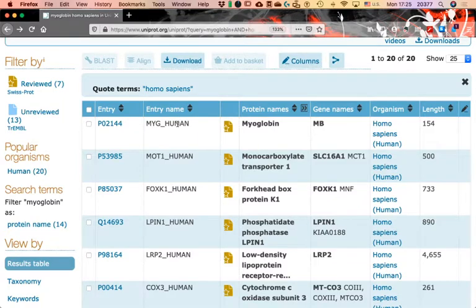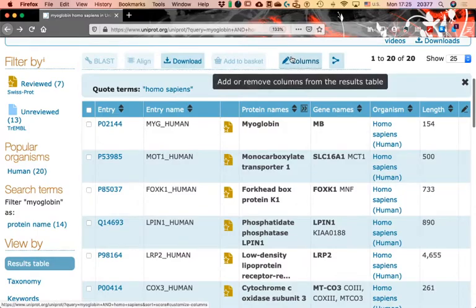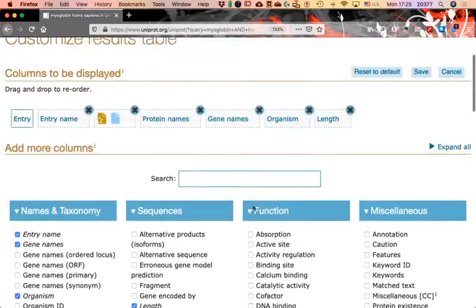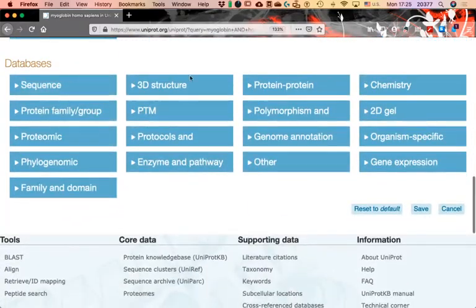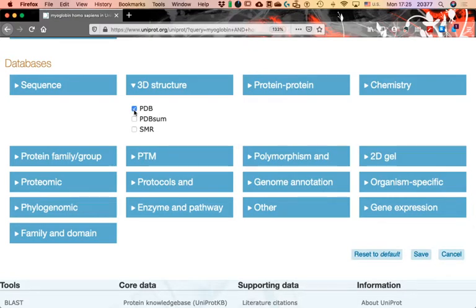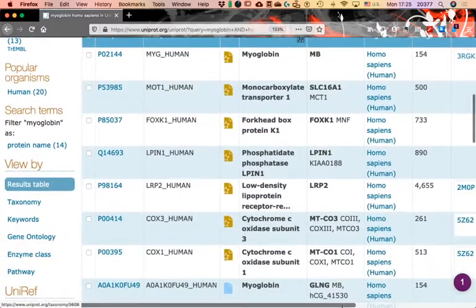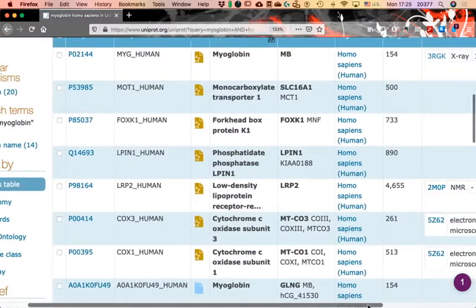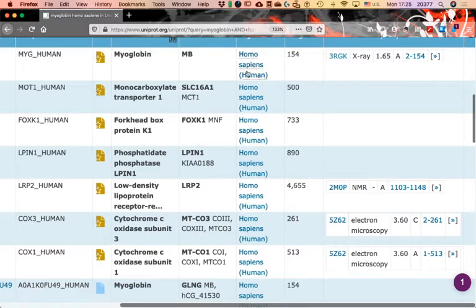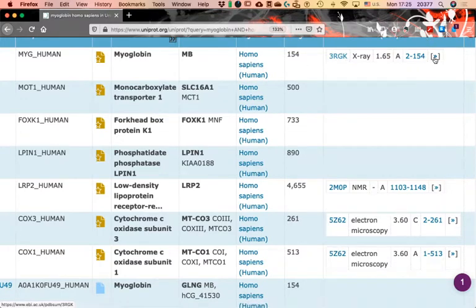On Columns, go to the bottom of the page to 'Databases,' and under '3D Structure' select PDB. Then click Save. After that, you'll get a new column to the right that indicates which of these entries contains structure.